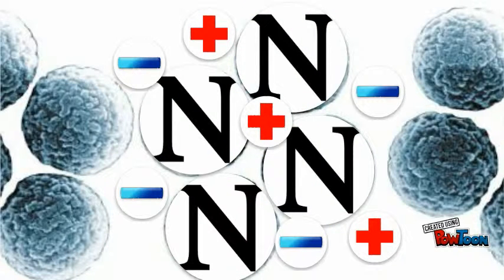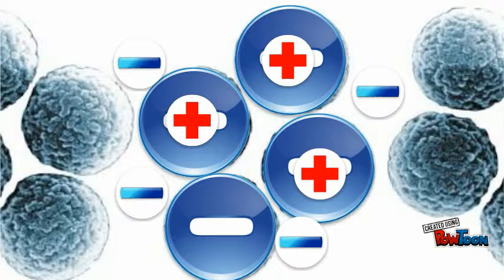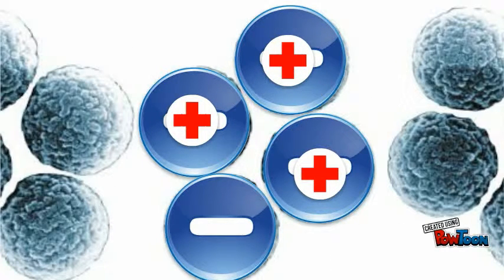The column is then rinsed with a base, which contains negative hydroxide ions and gives the beads a negative charge. This forces the desired positive molecules to stick to the resin beads, while undesired negative molecules continue to flow out and elute from the column.